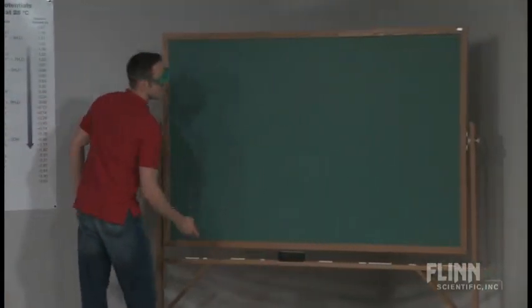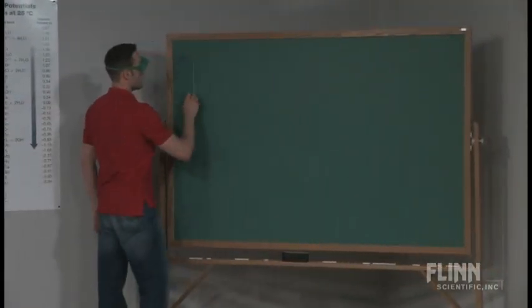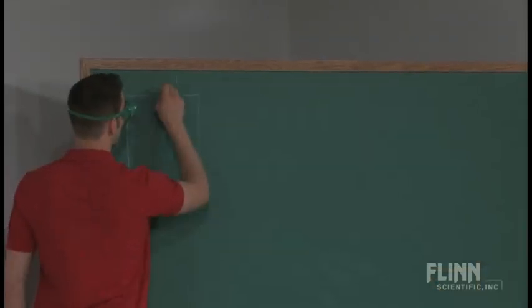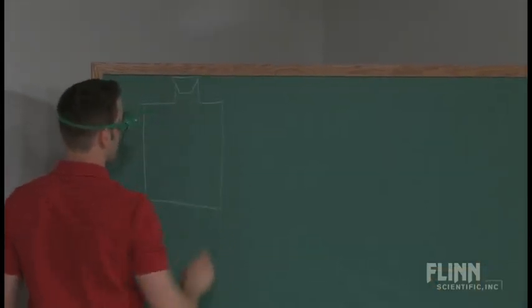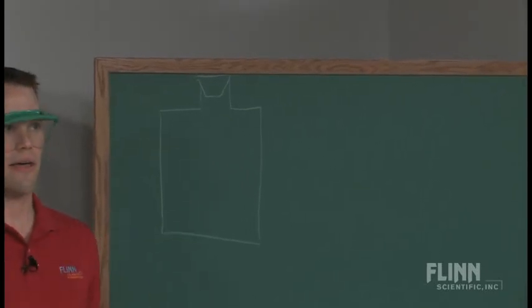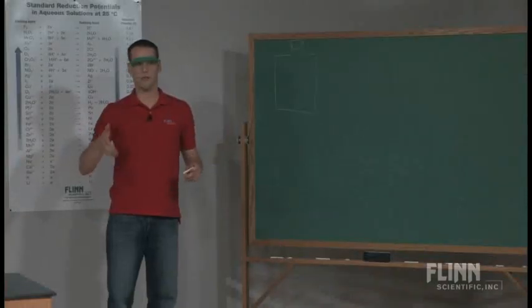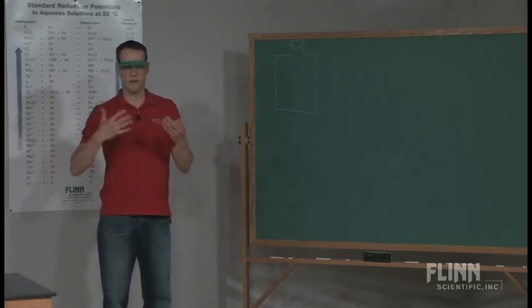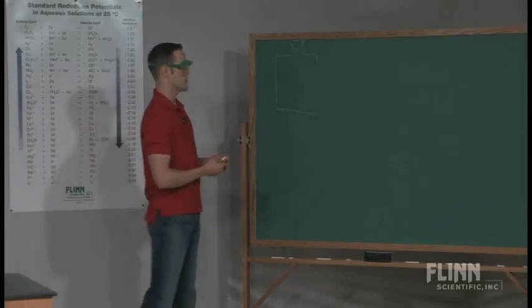One of the things that you have inside of this bottle, I found that my students in my advanced chemistry class, I just give them the blue bottle experiment at the beginning, and they hadn't seen it in my general chemistry class. I just put the bottle out there and I say, make observations. Some of them will eventually shake it and suddenly it turns blue. They weren't expecting that to happen. And so that's a good inquiry experiment for them just to start asking questions and making observations the first day of class.